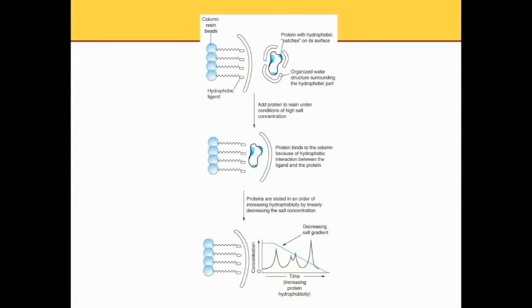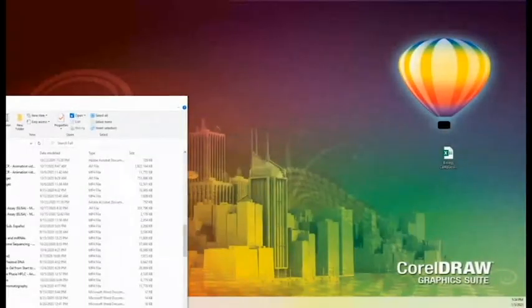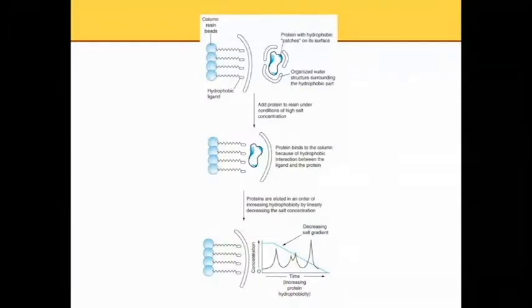Okay, and now I just want to show you a video about the affinity chromatography.